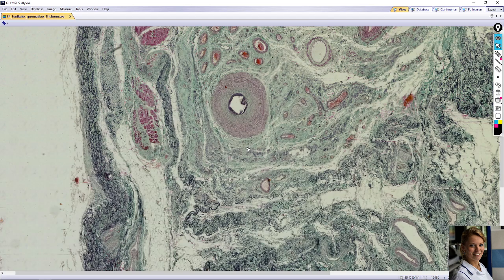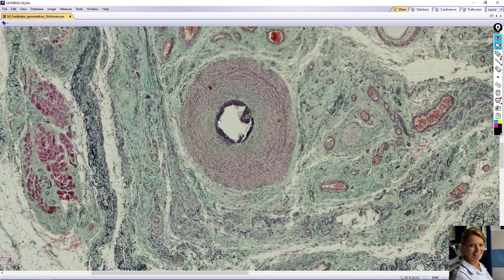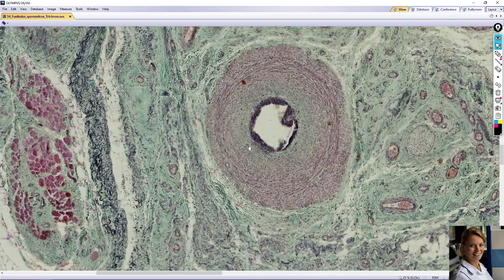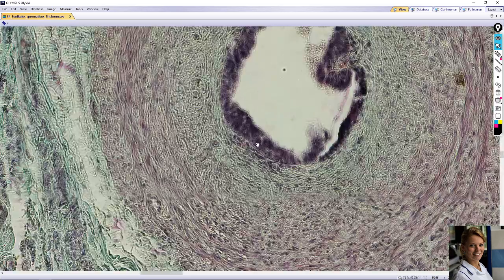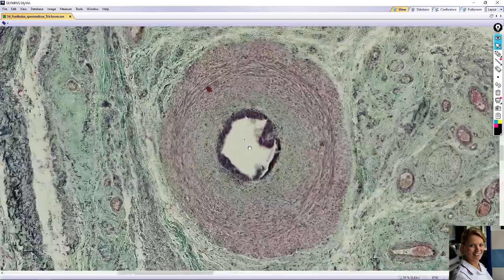The vas deferens has a thick muscular wall and a narrow star-shaped lumen. The smooth muscle is arranged in three layers: the inner and outer layers are longitudinal and the middle layer is circular. The lining epithelium is pseudostratified columnar epithelium, and the tall principal cells have long variations of microvilli called stereocilia. This is vas deferens.